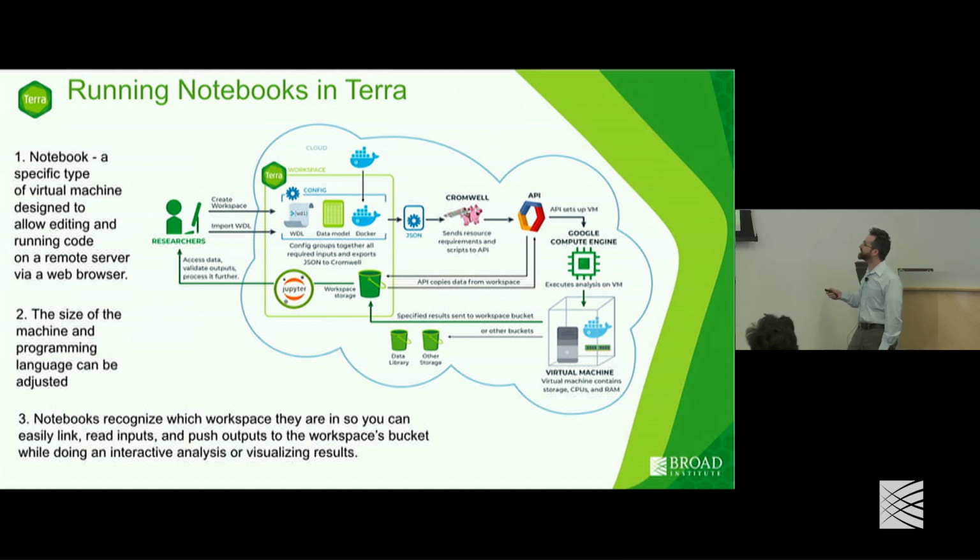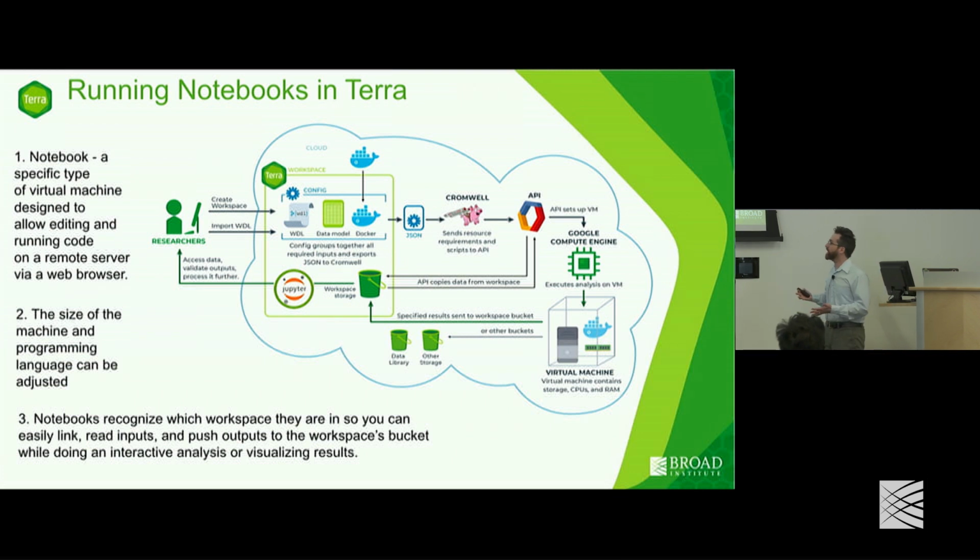So by contrast, the Jupyter Notebook does effectively the same thing, but you can interact directly with your code. So you can either interact with a workflow, or you can spin up a cluster, aka a virtual machine, just for your Jupyter Notebook. It's attached to its own workspace storage, and so you'll be able to do all sorts of things just inside of the Jupyter Notebook, which is specifically accessing your virtual machine. And that's great because the virtual machine is so elastic in terms of its computational abilities.